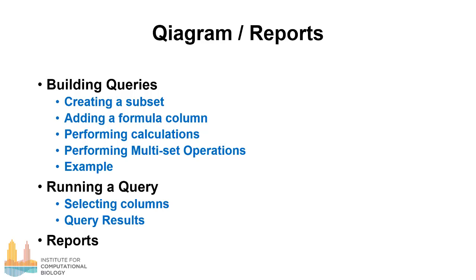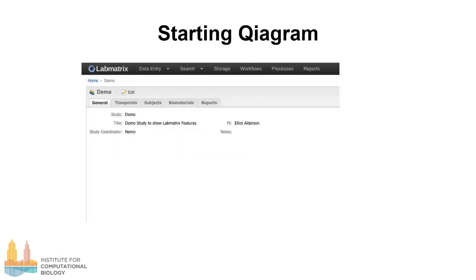Lab Matrix provides comprehensive functionality for querying and creating reports. In this video, we will see how to build and run queries using Lab Matrix's built-in Qiagram tool. Qiagram's unique drag-and-drop interface allows you to visually build a query, creating complex queries without any programming expertise.